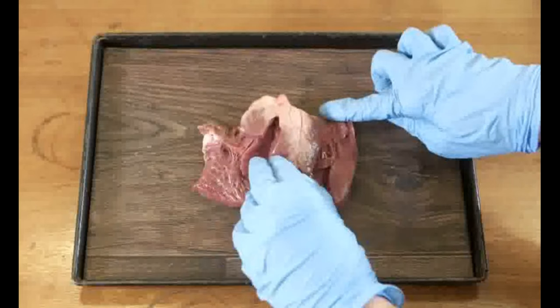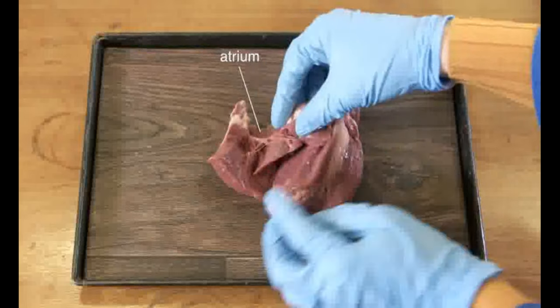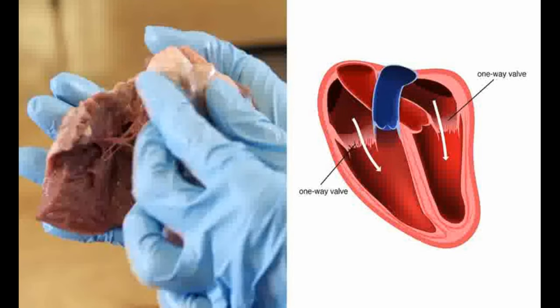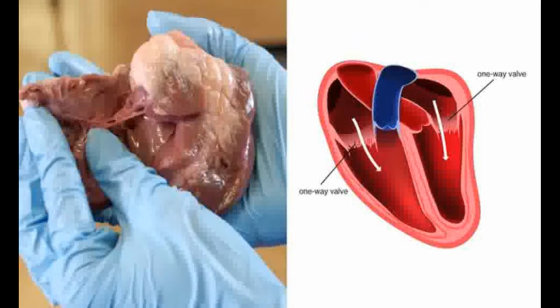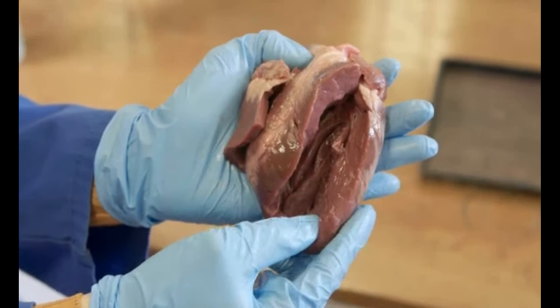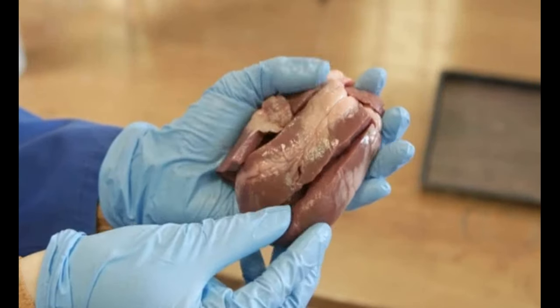This is the left side of the heart. The top chamber is the left atrium and the bottom chamber is the left ventricle. Here is the right atrium and the right ventricle. These are the one-way valves between the atrium and the ventricles. They allow blood to flow down from the atrium into the ventricles, but not back up again. These tendons hold the valves down. The muscular wall on the left ventricle is really thick because it needs to produce a large force to push the blood out of the heart at high pressure, so that the blood can travel all around the body and back again. The muscular wall on the right ventricle isn't quite as thick because the blood is only pushed from here to the lungs and back.